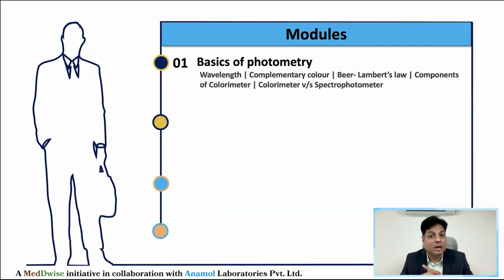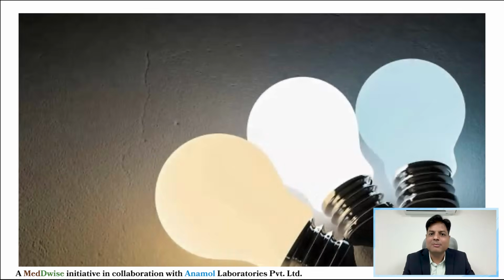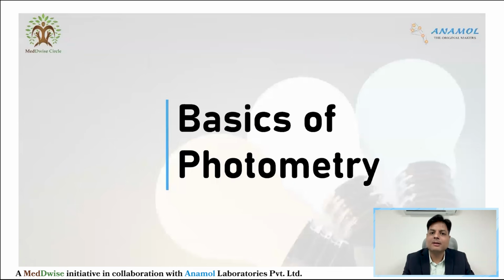But in our previous video, we have already discussed the basics of wavelength and complementary color. In this video, we are going to discuss what exactly is Beer Lambert's law and how we use Beer Lambert's law in our day-to-day life in the IVD industry. So without wasting time, let's go and understand the basics of photometry.